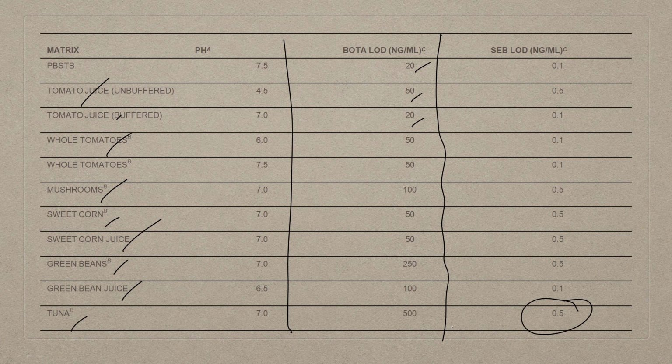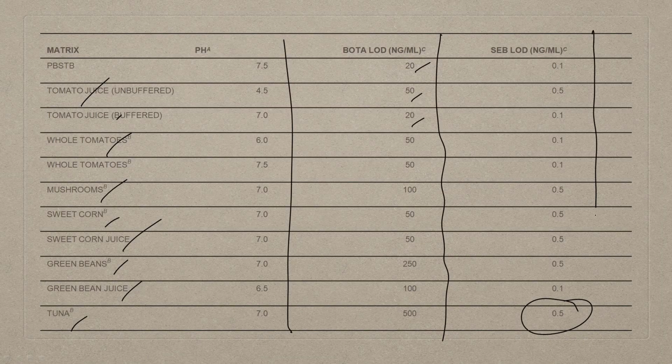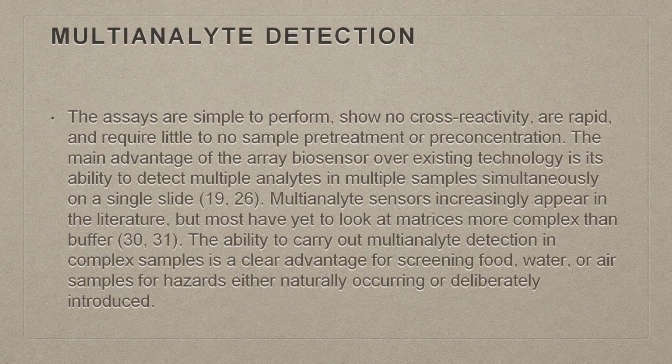In the last class, I told you that it all depends on what your detection limit is, and the detection limit should be unambiguous. When you are at the commercial level, if I say 0.1, then it should be almost 99%, maybe more than 99%, it should be 0.1.